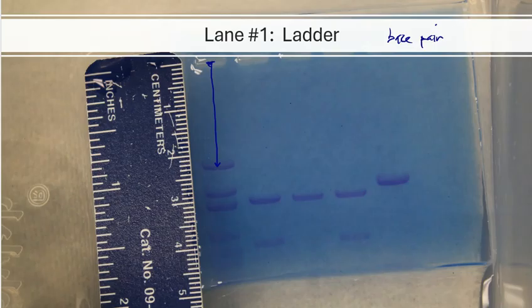And then there are other bands that are there. So they begin to separate out, different chunks separate out from each other. And then we actually even see bands down here at the very bottom, right? There's a band that's right there. And that is probably a smaller band, and that smaller band is going to travel the furthest, and here it almost ran off of the edge of the gel.